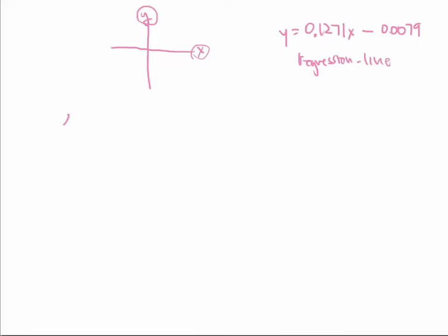Okay, so what I need to do is that I have two variables here, an x and a y. Because of the way that I set it up, x is going to represent percentage and y is going to represent my density. Well, I've already said I've taken an unknown solution and I got a density measurement of it. 0.75 is what I got. Let's pretend 0.75.